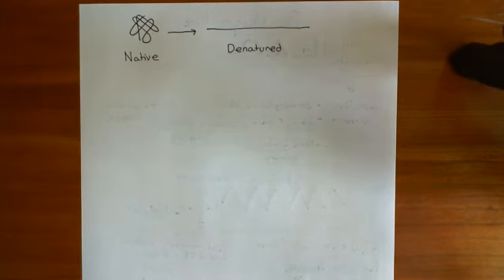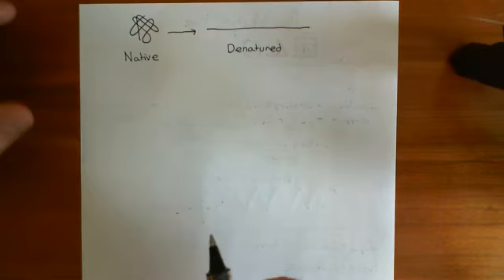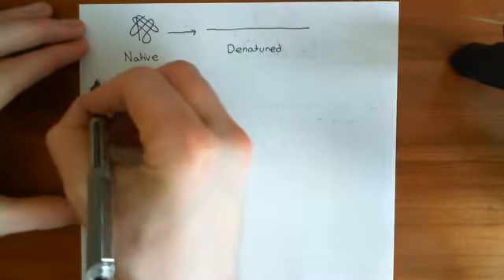The secondary interactions are between the core amino acid structures, so the carbonyl groups and the amino groups of the peptide bonds. Those don't involve the R groups. The tertiary interactions involve the R groups. We want to break both of them. Now, most of these bonds can be broken just by heating the samples up, so that's what we'll then do.